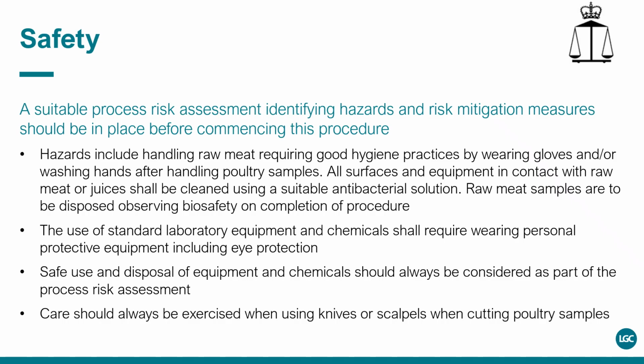As with any method using laboratory equipment, chemicals and meat samples, there must be consideration of hazards and risks in the procedure, not forgetting the sample may contain a bacterial hazard. This slide provides some of the processes that should be considered.